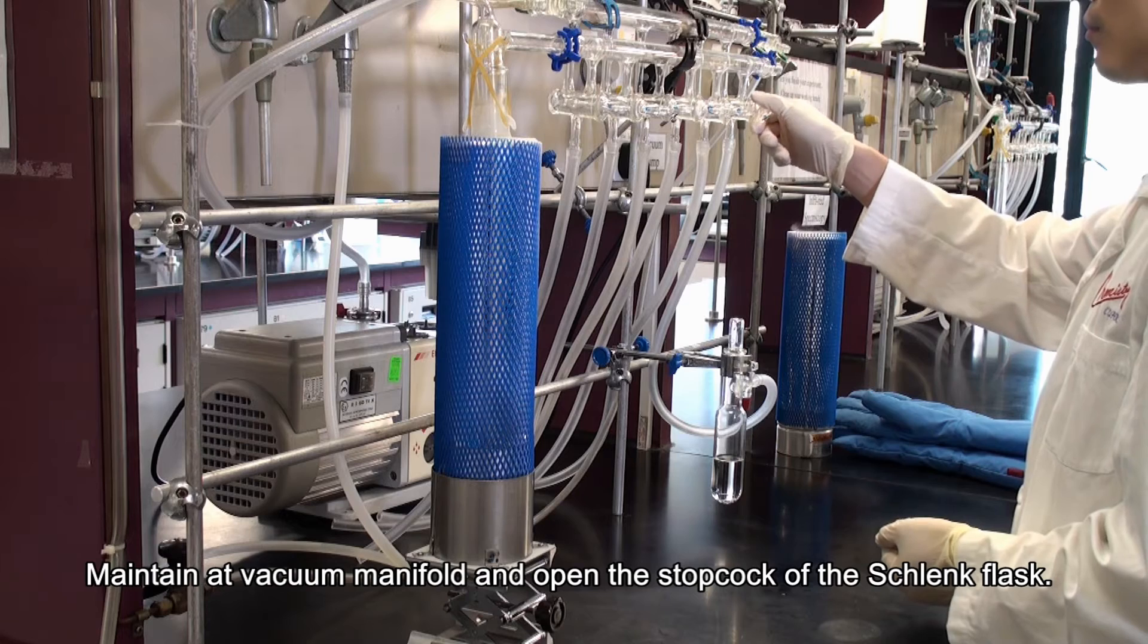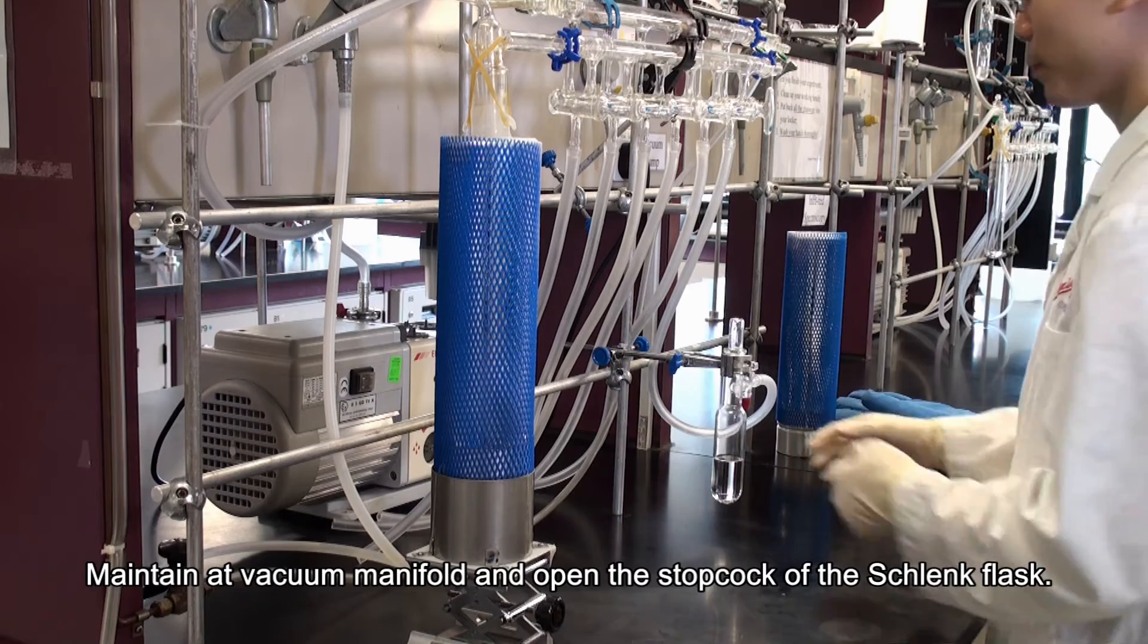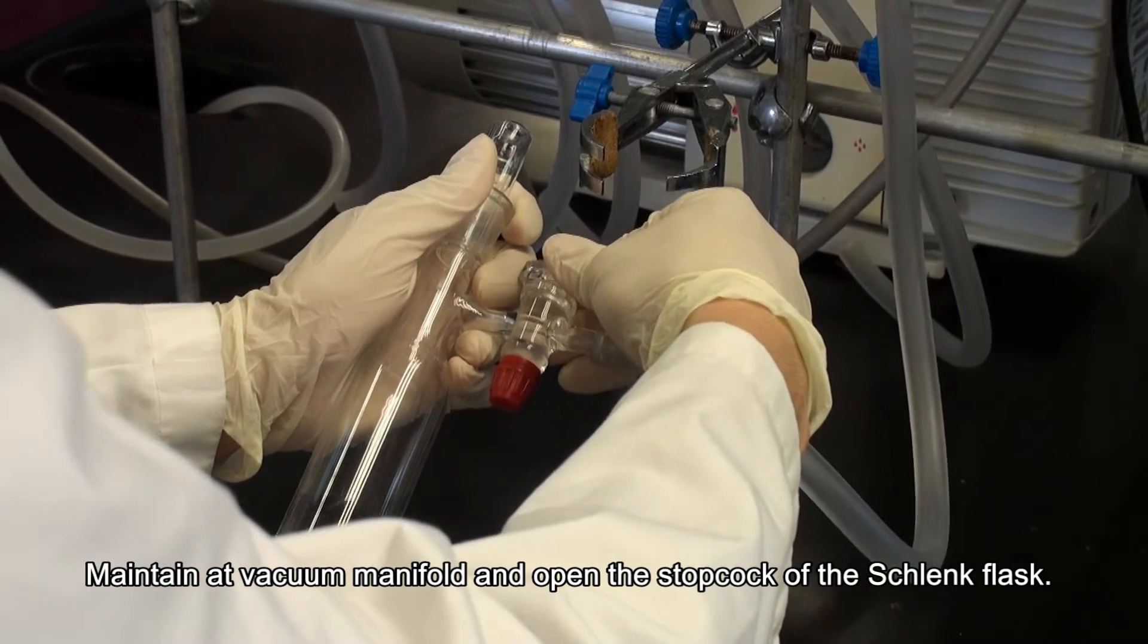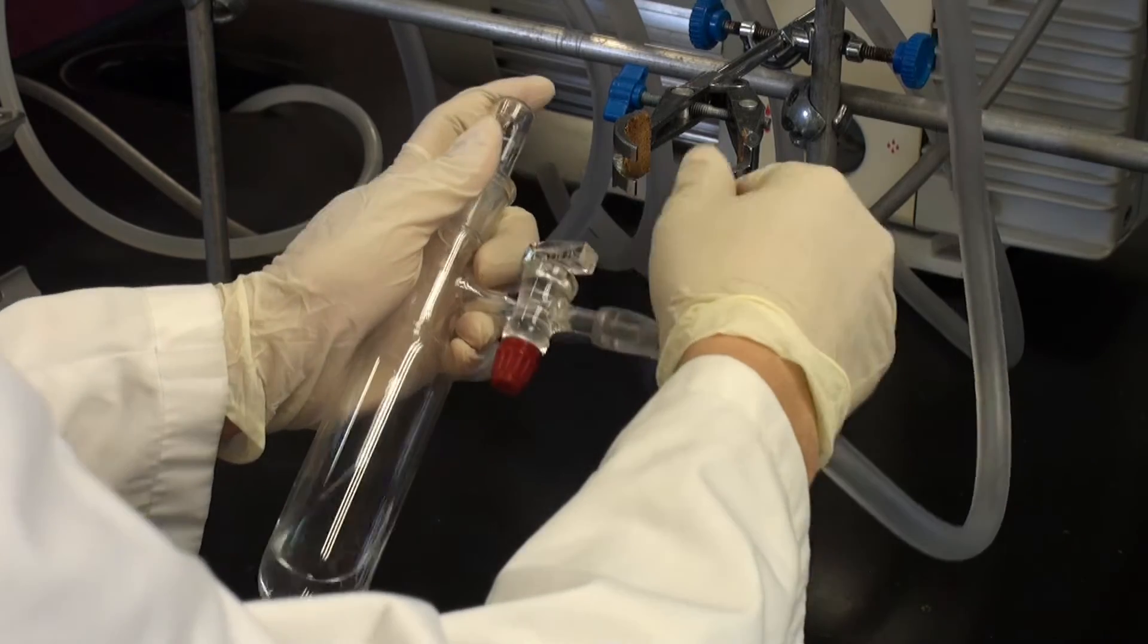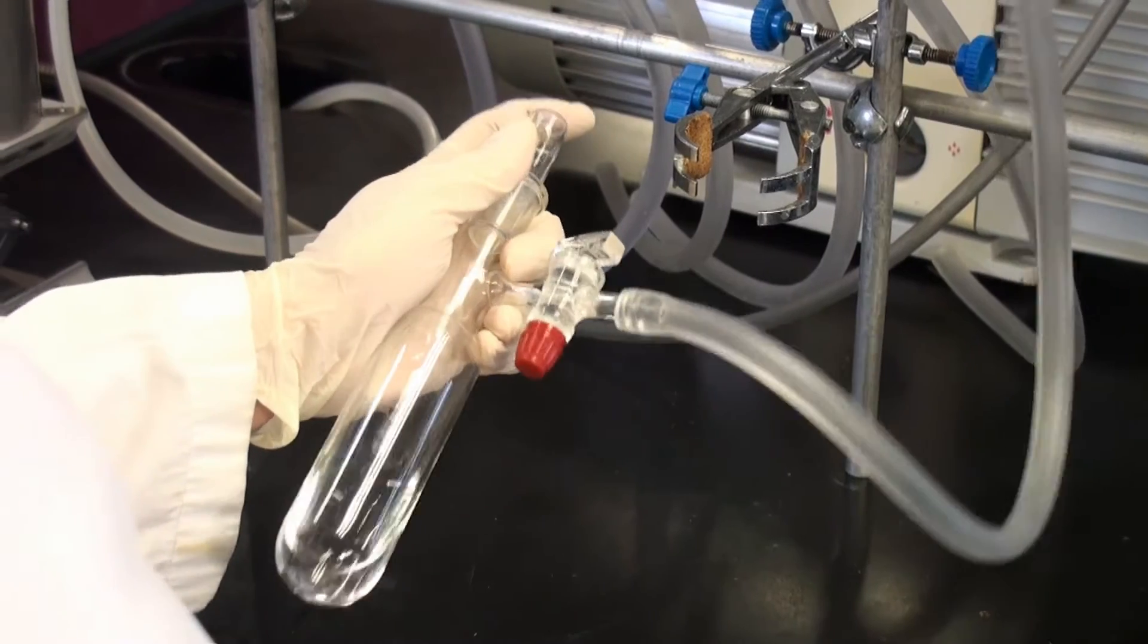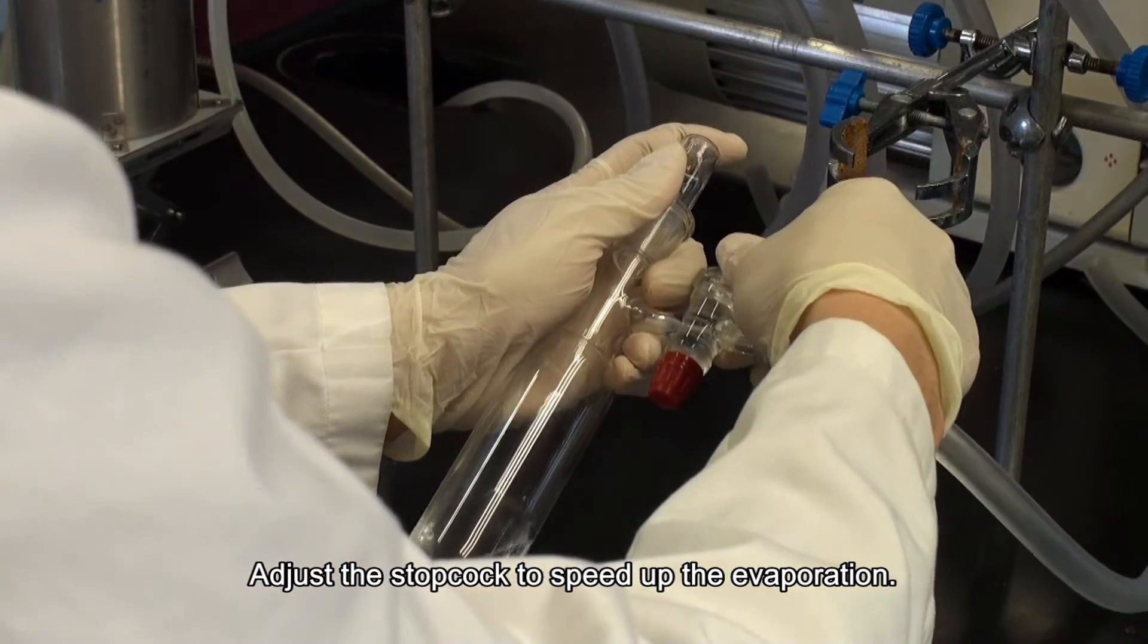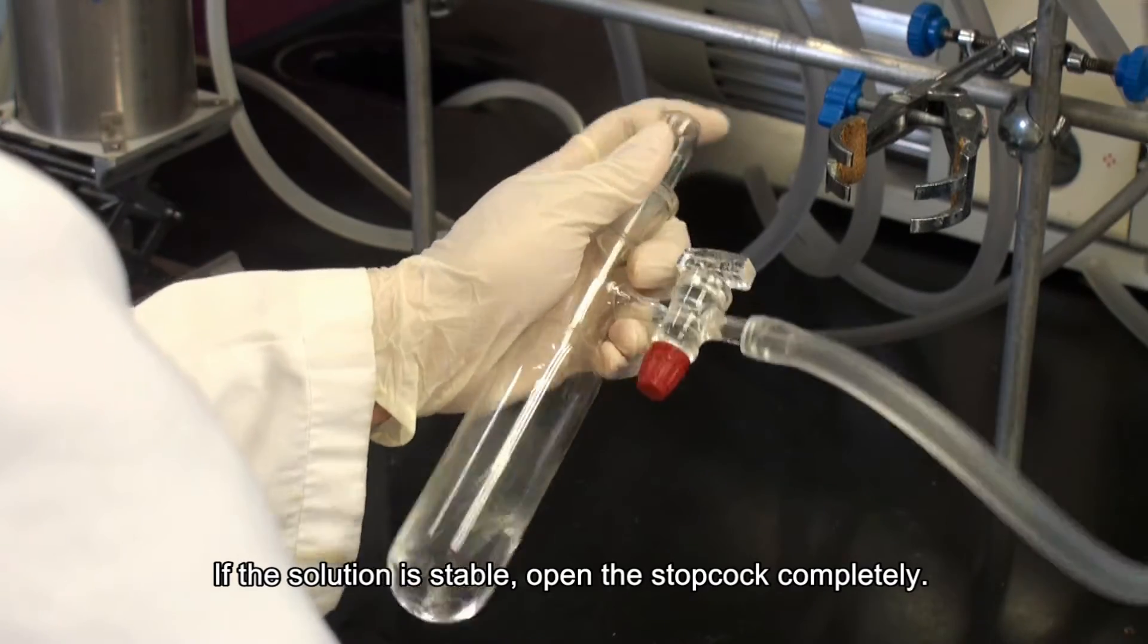Maintain a vacuum manifold and open the stopcock of the Schlenk flask. Gently swirl the Schlenk flask. Adjust the stopcock to speed up the evaporation. If the solution is stable, open the stopcock completely.